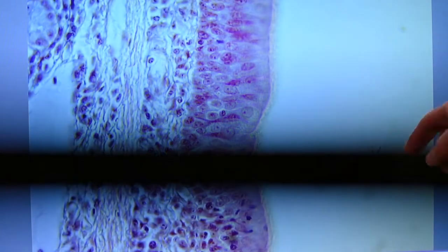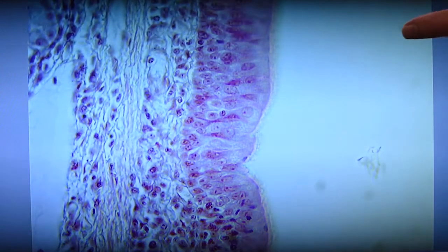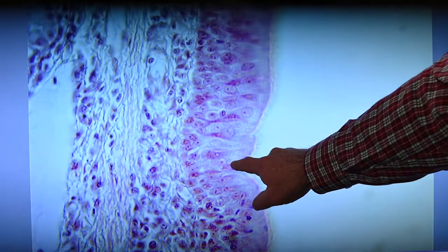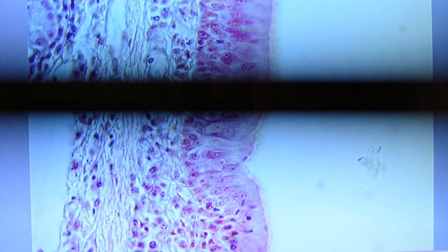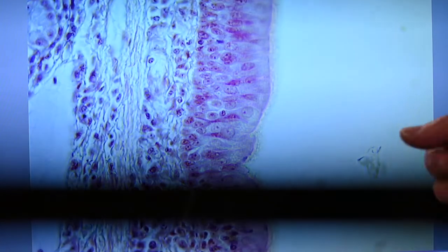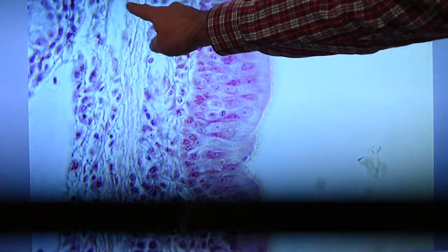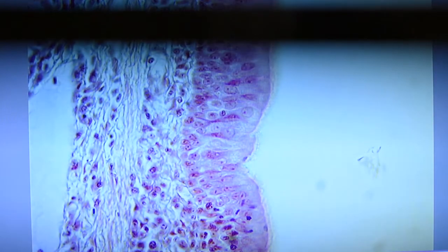Close-up view of the mucosa, we have our ciliated cells. You can see the cilia along the top. Our mucus cells are not showing up real well in here. I see a little bit of this mucus substance, I guess I should call it. So there's like 1, 2, 3, 4, 5, 6 little light dots right in there. Those are little granules of mucus up there in the top of that mucus portion of that goblet cell. Next would be our lamina propria zone right through here. It extends to this layer where you see not many nuclei, but lots of fibers in there. That's the elastic layer. Beyond that would be the submucosa.